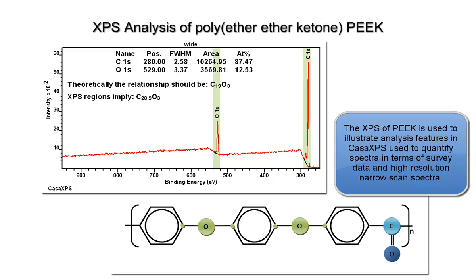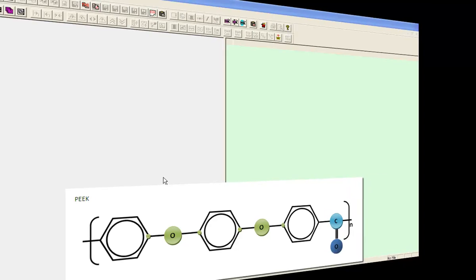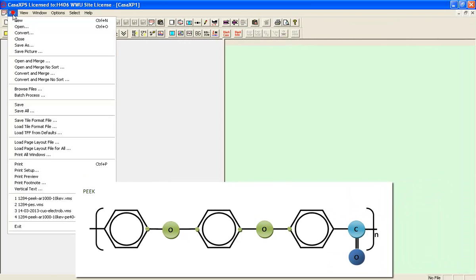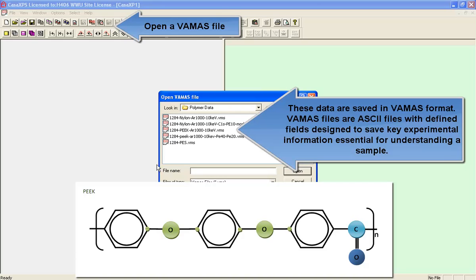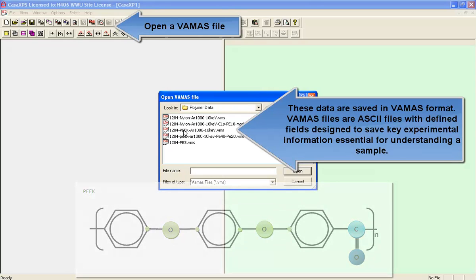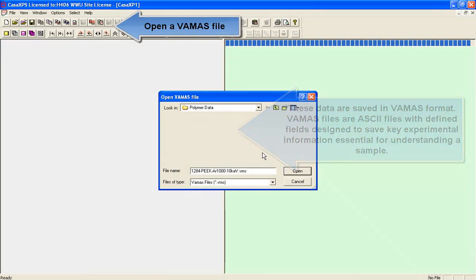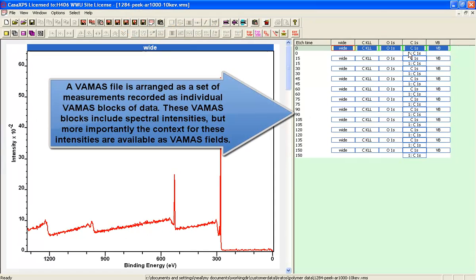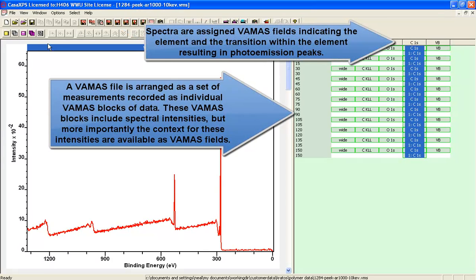Polyether ether ketone is a good example for XPS. It contains benzene rings, oxygen in two different chemical states, and so we can expect to see chemical state information, that is to say chemical shifted peaks in both the oxygen and the carbon high resolution data.